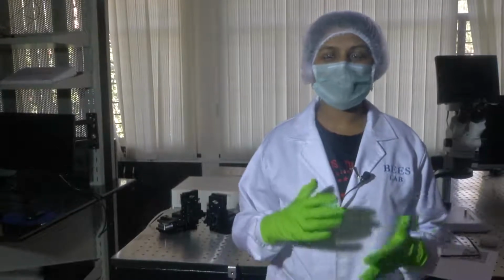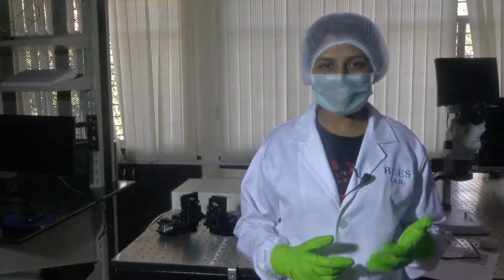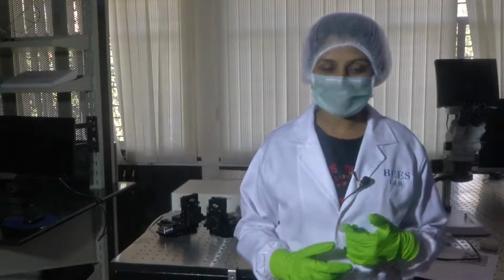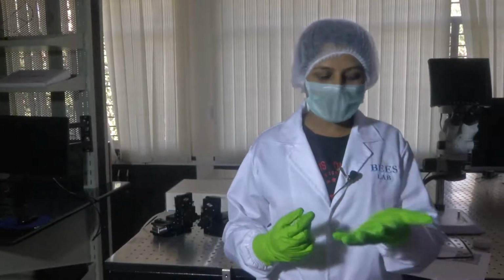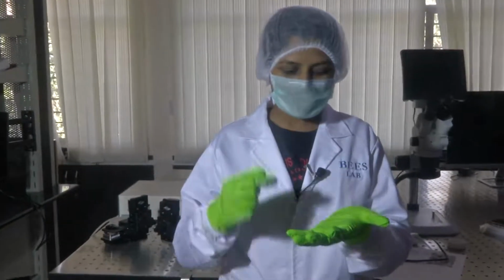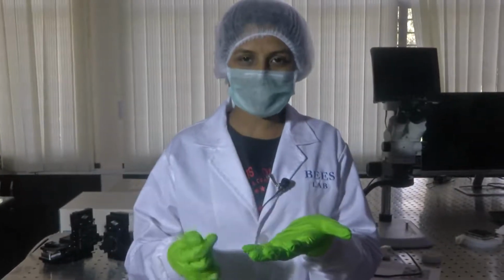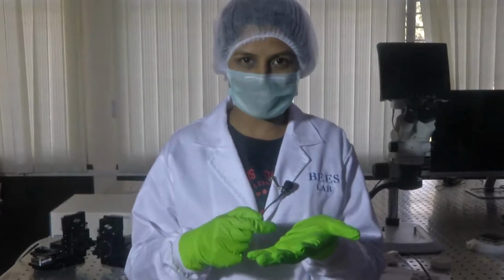Today let's study more details about micromanipulator. Even before we get into understanding what is a micromanipulator, let's understand some basics about soft tissues and their biomechanics. The research says that when disease is being diagnosed, there are structural changes in the cells or tissues. So, these changes in the structural features can be leveraged using the change in stiffness parameters.